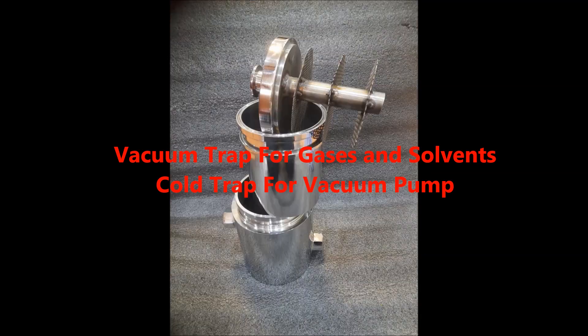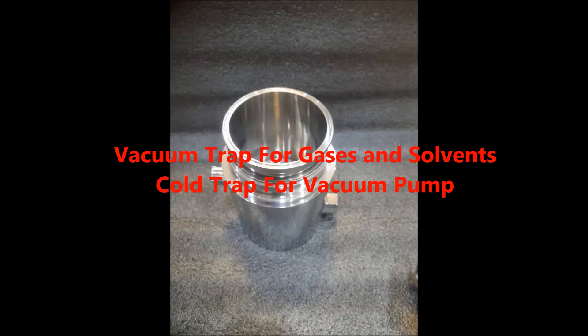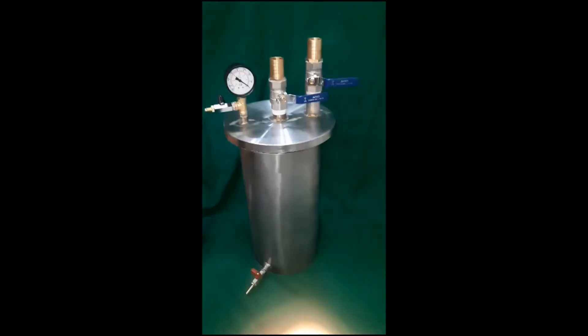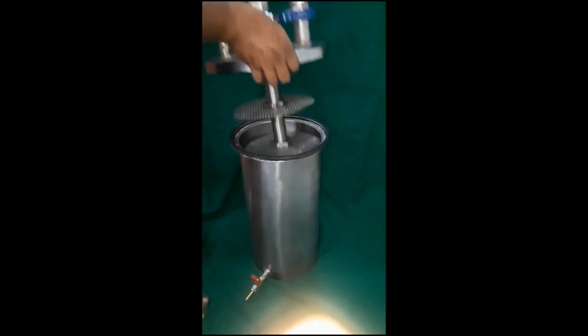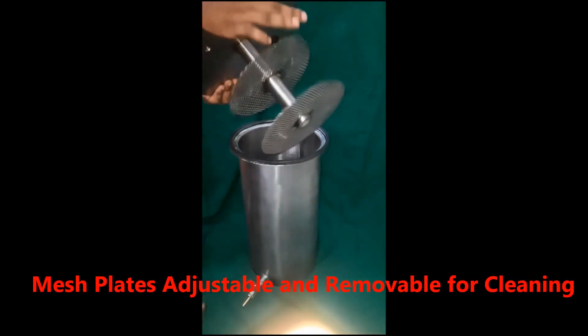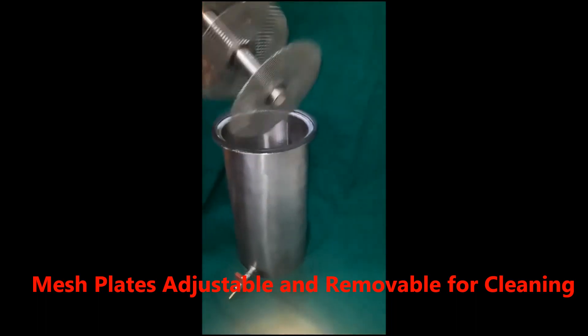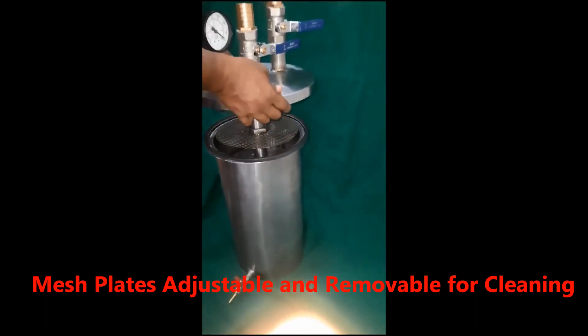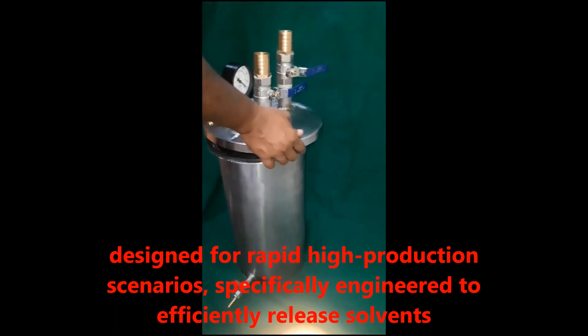Vacuum Trap for Gases and Solvents, Cold Trap for Vacuum Pump. Burhani Engineering Technology proudly presents an advanced vacuum trap designed for rapid high-production scenarios, specifically engineered to efficiently release solvents.